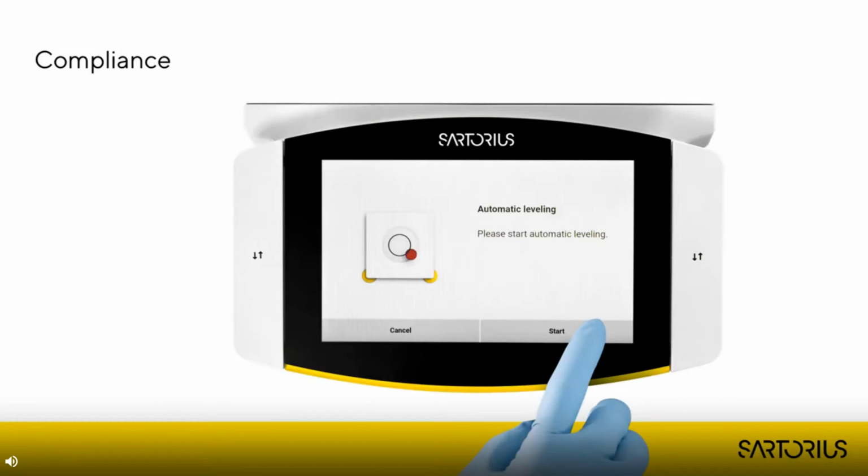I would like to start with a brief introduction to the topic of data integrity, and after that I will show examples from FDA warning letters of different data integrity violations and how these can be prevented by using a modern laboratory instrument.